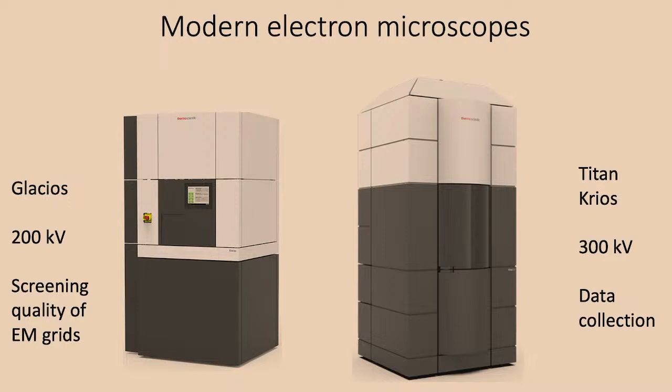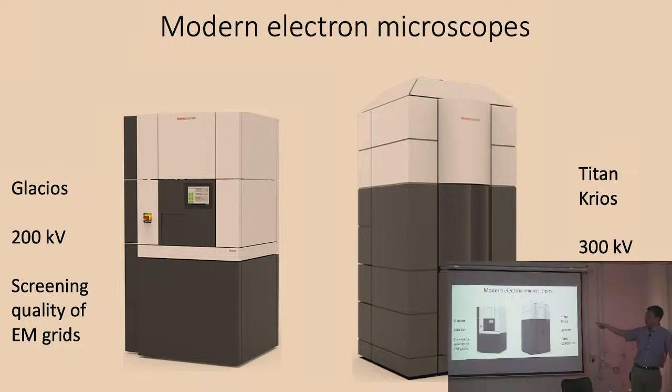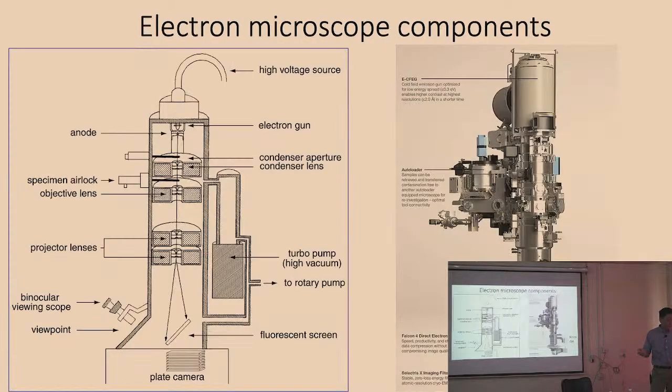And New York is actually very good in terms of the infrastructure that we have. We have access to one of 9 different cryo-EM instruments in the New York City area. That's only part of what's available in New York City. Other universities have their own as well. So it's a very good infrastructure.